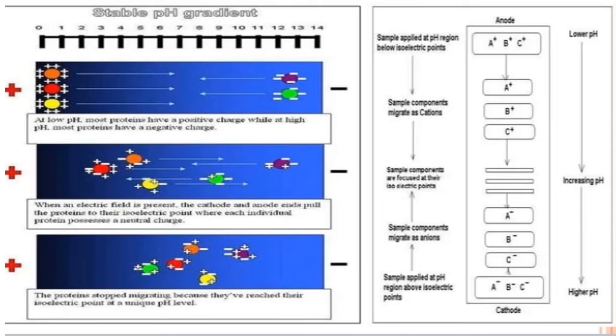So now if we want to determine the isoelectric point for this one, we may say that maybe it's 5 or 5.1, 5.2, somewhere there will be the isoelectric point for that green protein. So now let's have a look at the other part. Now we see how these things are moving, where there is A, B, C.